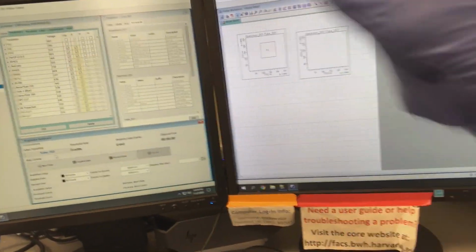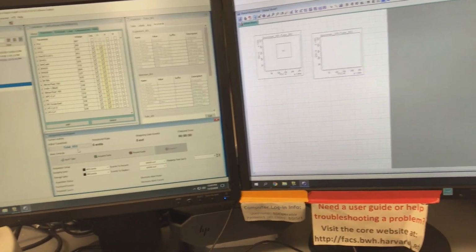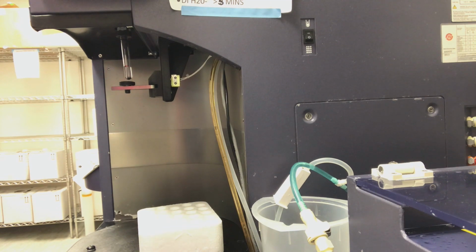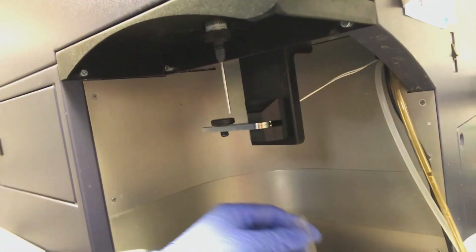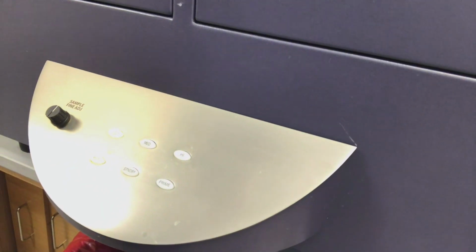Now that's because an air bubble got into the flow cell and is actually deviating the stream and missing part of the laser. Like I said, it's a little tricky to diagnose, but if you think that's what you have, as I mentioned with the clog, please check all your air lines and make sure the connections are fit, and then go through the priming steps by removing the tube with the arm to the side, and then prime 2 to 3 times.